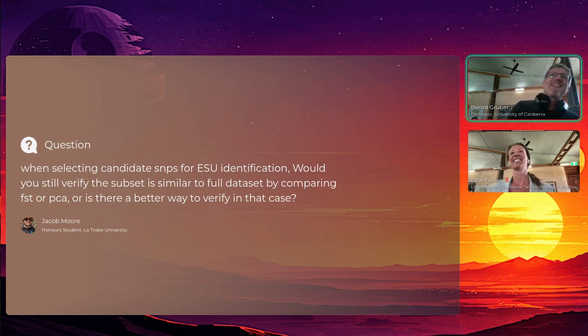I think maybe this person's asking if I'm wanting to look at gene diversity, would I use the FST comparison you've shown, and the answer is no. Okay, no. If that's the question, that's true. We haven't shown that, but you obviously can also select a panel for heterozygosity. Maybe I should have, I think I skipped over that. When you say in the GL select panel function, yeah. Do you want to share that? Oh, yeah.